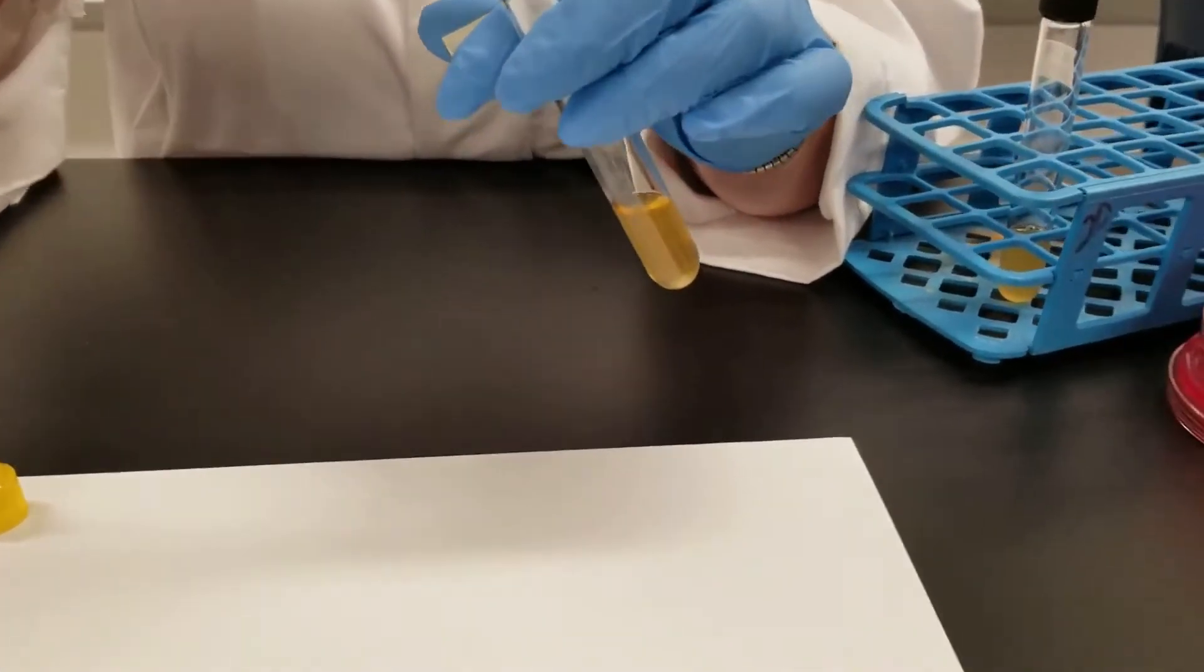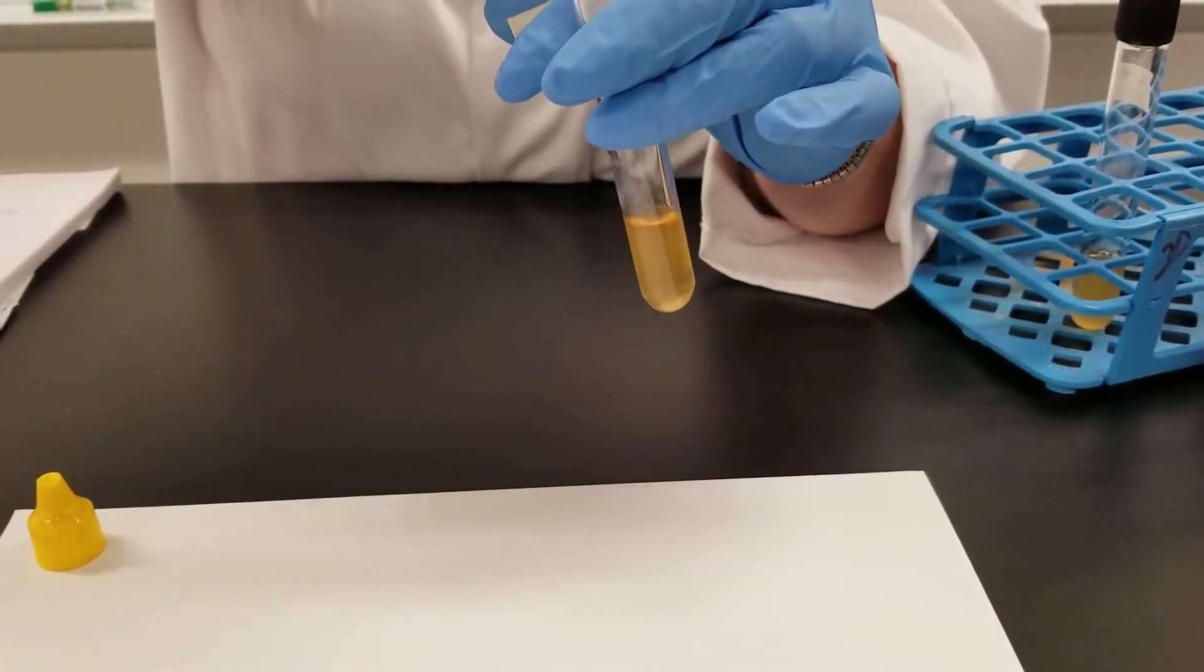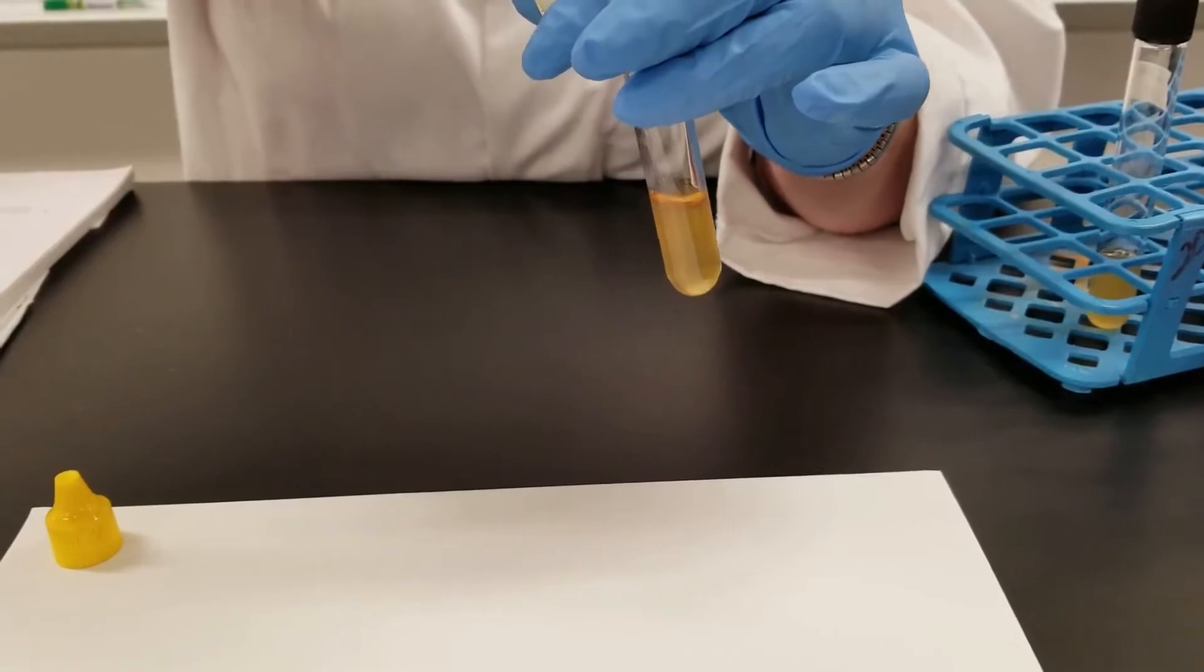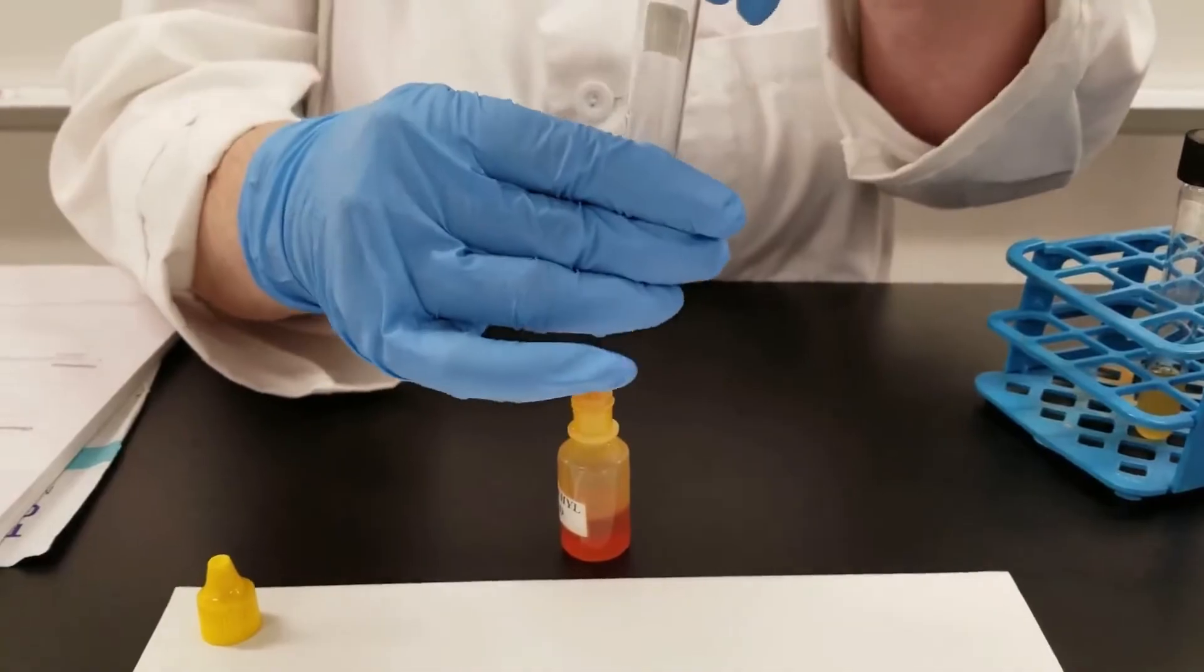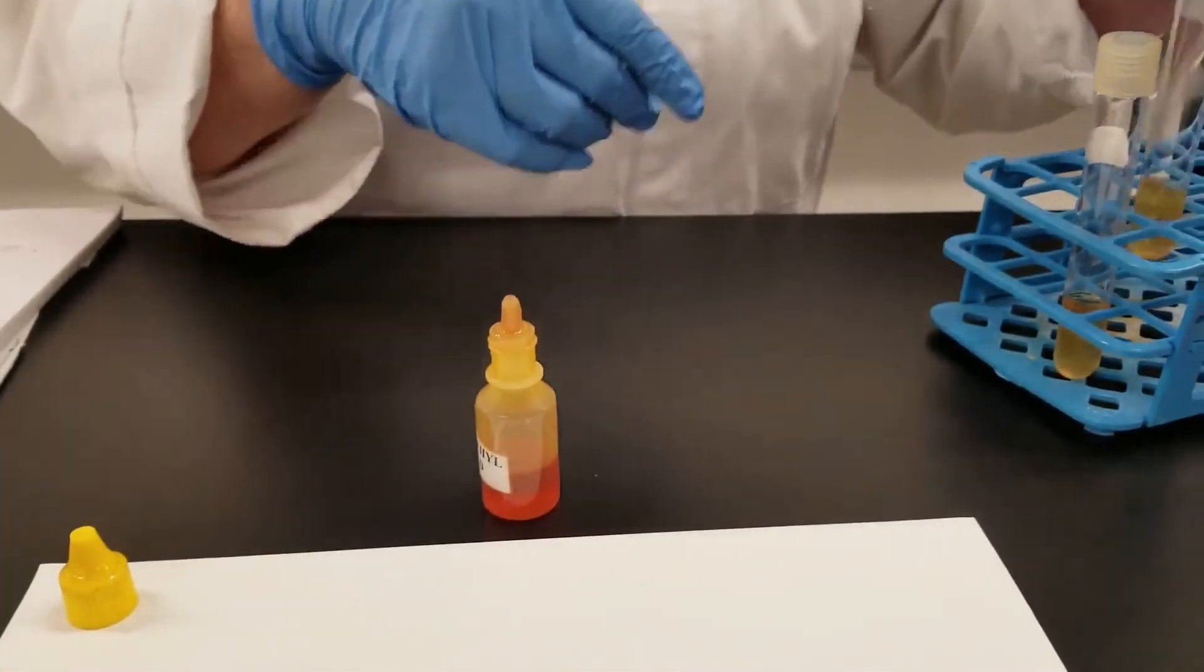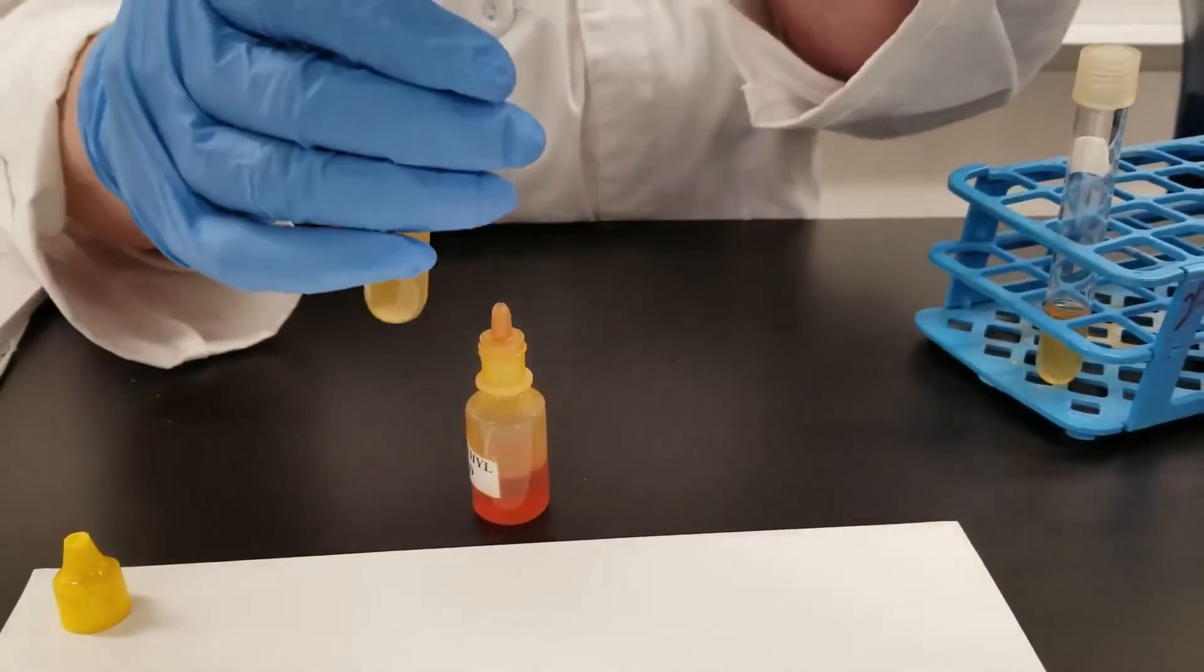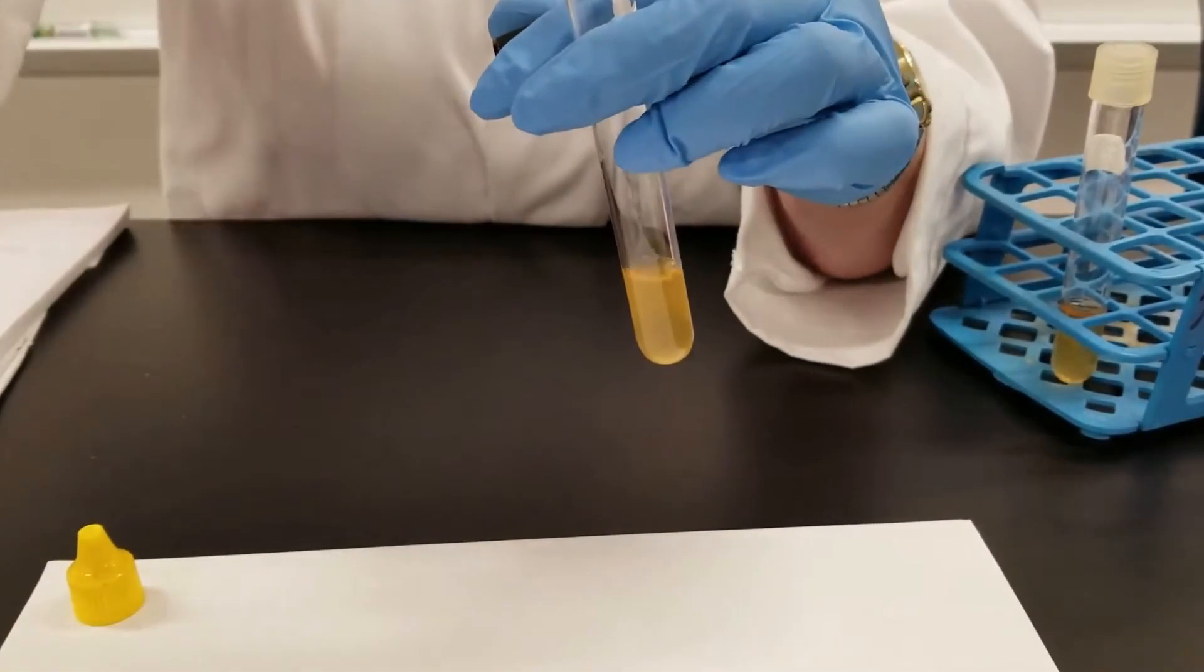We add five drops of the methyl red. We will let this sit for a moment, and then to the other tube, which is Enterobacter aerogenes, we are adding five drops of methyl red to it as well.